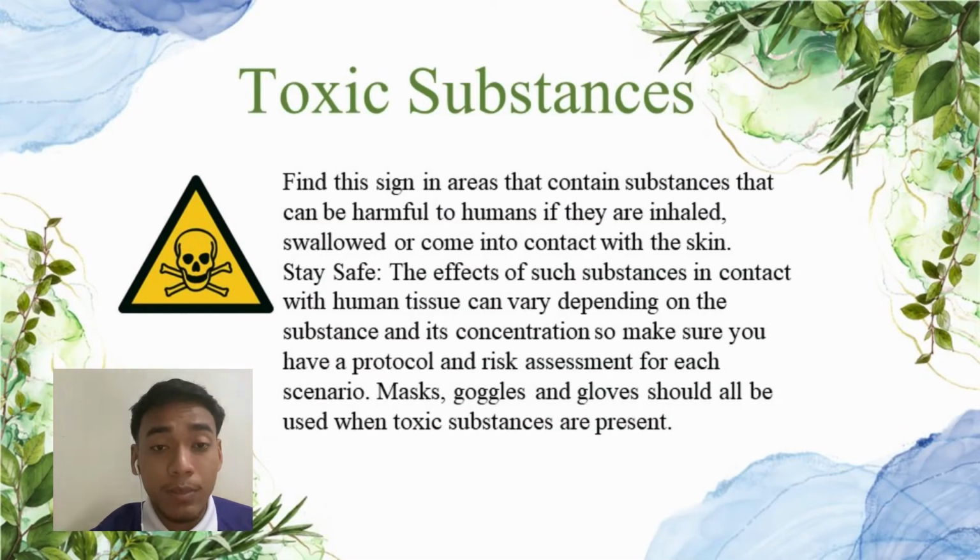The second symbol is toxic substance. You will find this sign in areas that contain substances that can be harmful to humans if they are inhaled, swallowed, or come into contact with the skin. Stay safe.